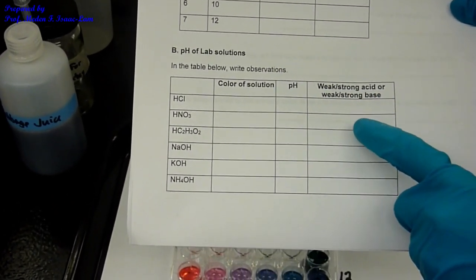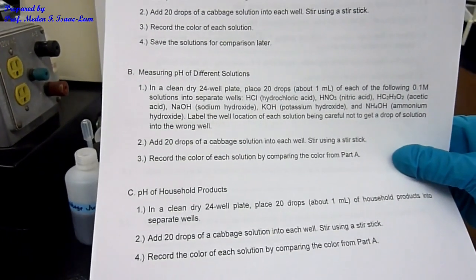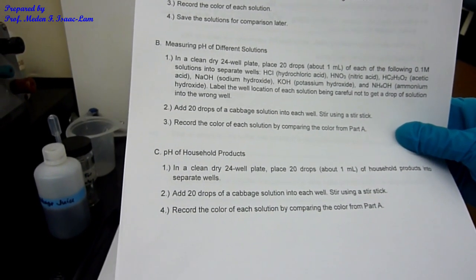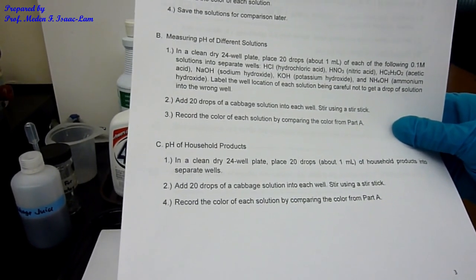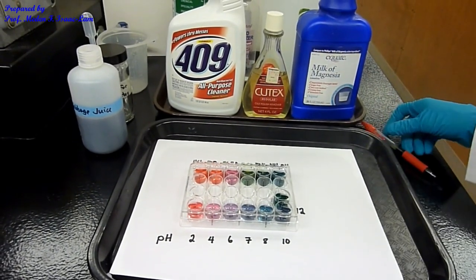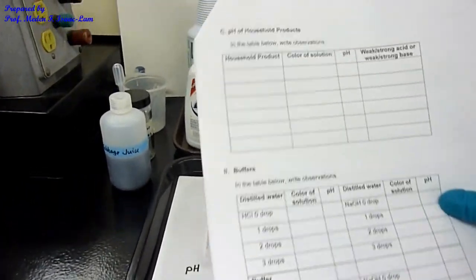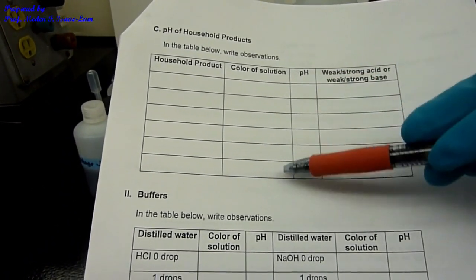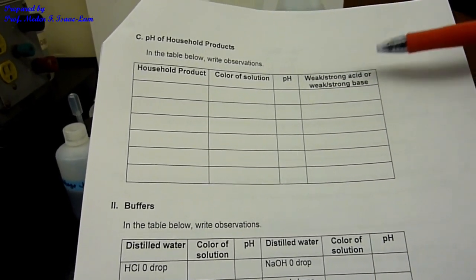And you are now going to identify if that solution is a weak or strong acid, or weak or strong base. Part C is about pH of household products. The same idea: we're going to put about a ml of each of the household products and then add 20 drops of the cabbage solution, stir it, record the color, and compare it to the color from part A. I still have the standard solutions up here, and these are the household products. You're going to write in this table the household products. I have six, and we're going to determine the color of the solution once I mix it with cabbage juice, determine the pH, and then identify whether it's a weak or strong acid or weak or strong base.